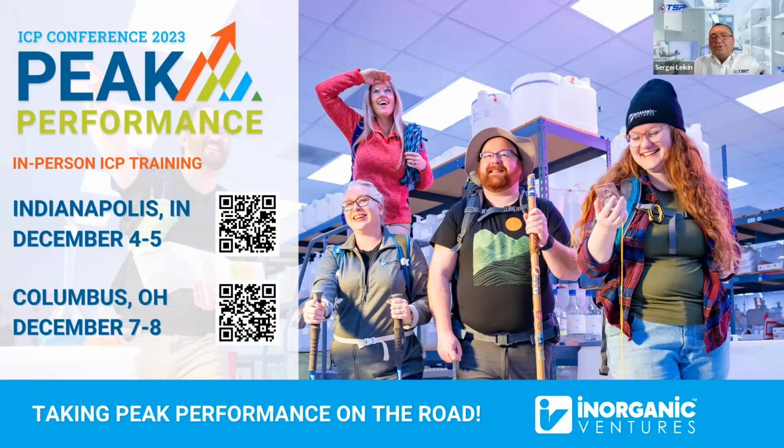I think she's just asking because they don't have a glass spray chamber. I see. Yeah, that should have been pointed out. The evaluation of the mist can be done when you have a glass or quartz spray chamber. When you have something made from Teflon or non-transparent material, obviously you can't do it. The same thing goes for the ceramic torch: you cannot see the bullet. That's in my view one of the drawbacks of the ceramic outer shields that have been out on the marketplace, because seeing the plasma tells you a lot many of the times, and you're working blind with the ceramic torch.